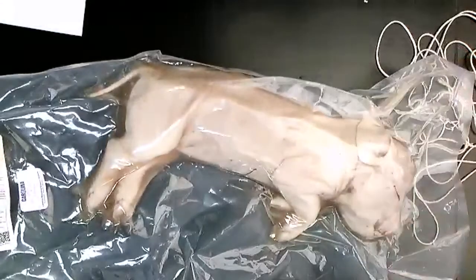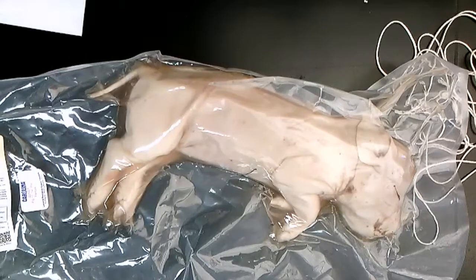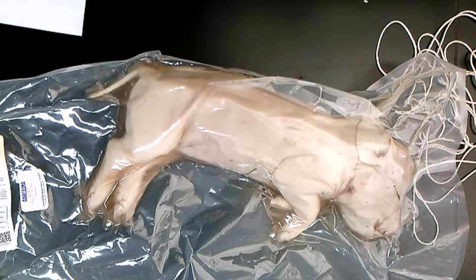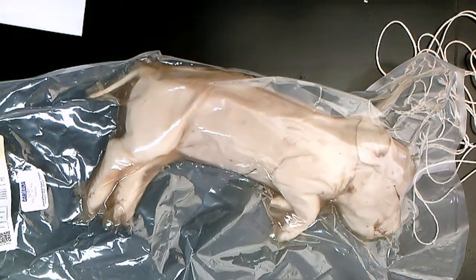So I'm going to walk you through the entire process of dissecting a pig, but I want to just say that there are lots of YouTube videos on how to dissect fetal pigs online. Each one of them takes a little bit of a different approach to the dissection. So there's not necessarily a correct or incorrect way unless we are totally butchering the fetal pig and we are cutting through the organs where we can't identify them. So this is just one way that works for me and that I'm going to share with you.